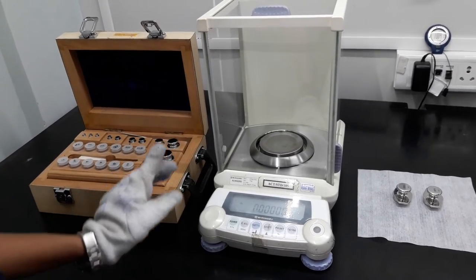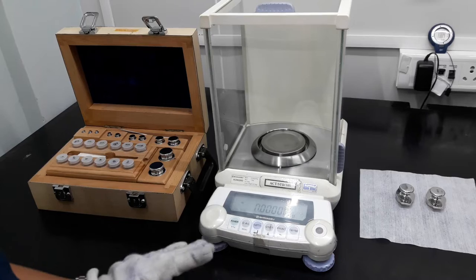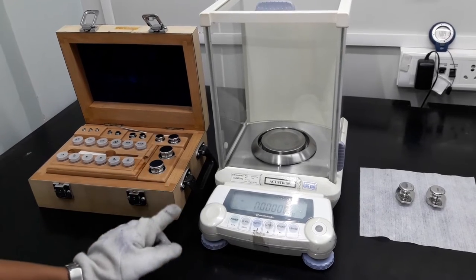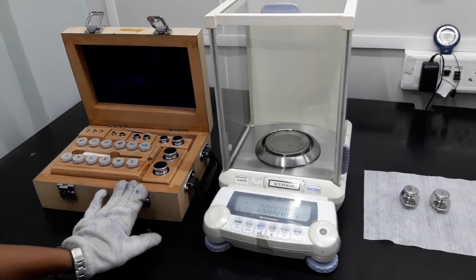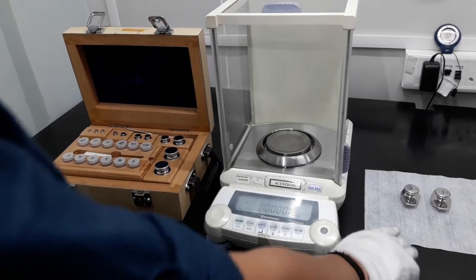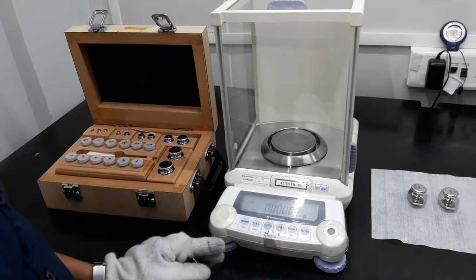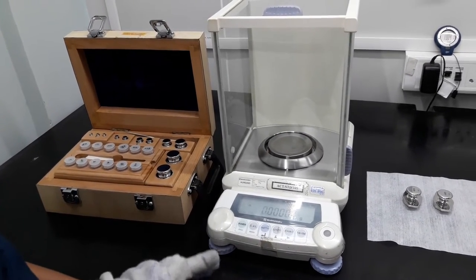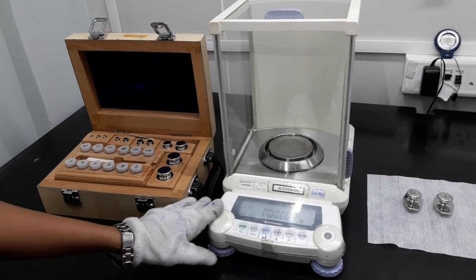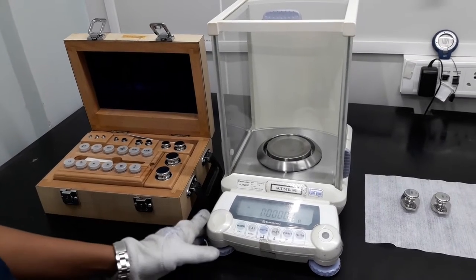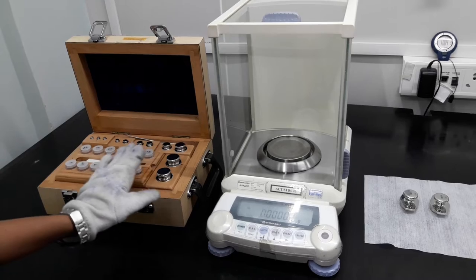Analytical weights are calibrated by ABBA method, where A represents weighing of reference weight and B represents weighing of test weight. This will be calibrated on a dual range weighing balance of class 1 and analytical stainless steel weights of E1 class.